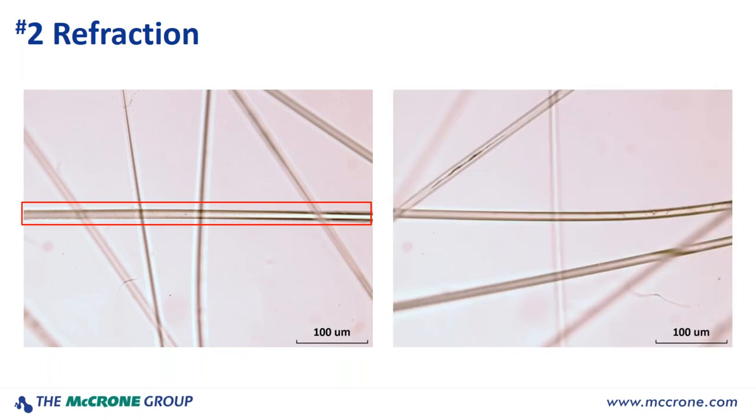The same fiber oriented perpendicular to the analyzer, north-south, showing low contrast or relief. Here I have the same fiber that you saw previously, and now I've just rotated it 90 degrees, and it's showing low contrast. When light passes between two transparent materials with similar refractive indexes, contrast or relief is low at the interface between the materials, or edges. So the orientation, again with the rotating stage, of a fiber or crystal allows me to determine the different contrasts associated with different crystals or minerals.